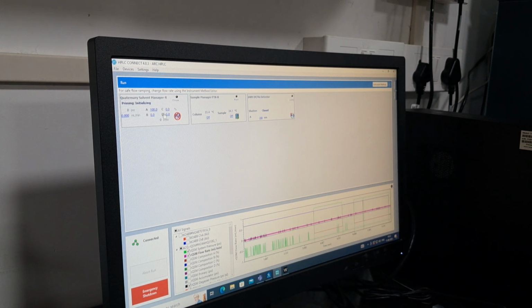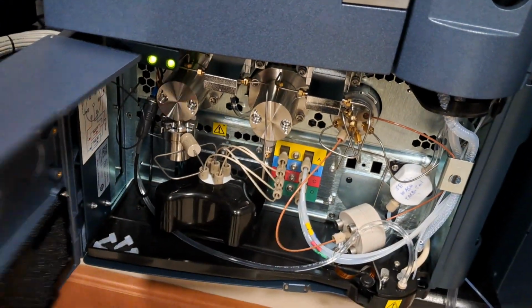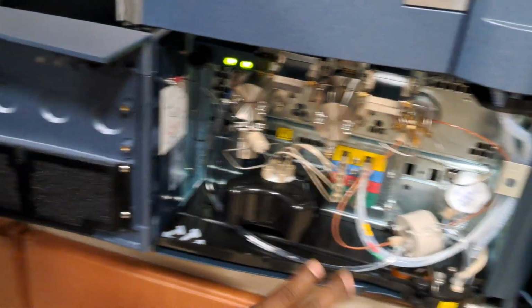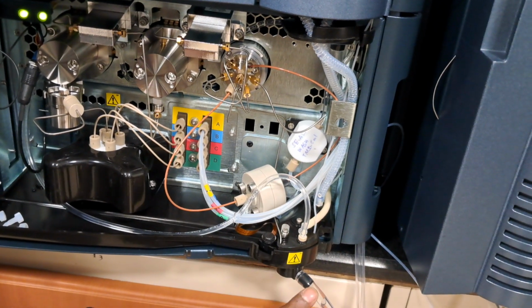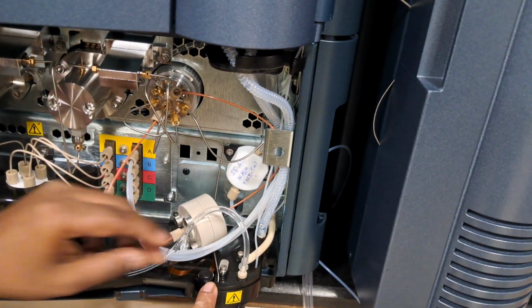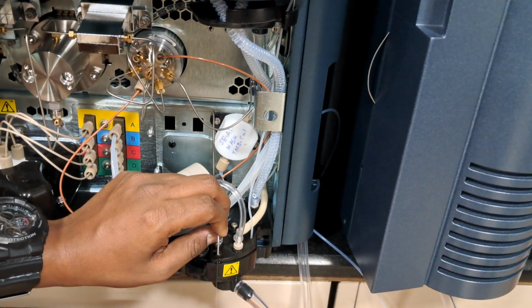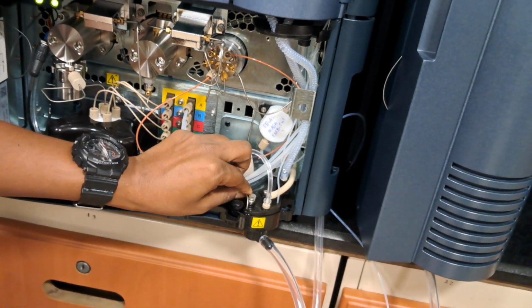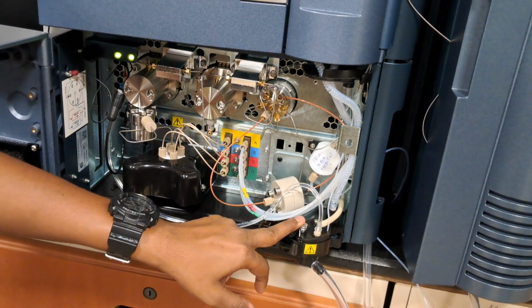You want to show the outlet flow. The outlet flow, we have to check it. Now the pump earlier was in off state. Now it will come to the flow. Now the pump flow, it will come through this one, the pump priming actually. So you can see the flow is coming here. This channel is the one. No need to take it out. The flow will be coming in a very fast direction. So this is called the pump priming, wet priming or pump priming. That initial one was seal wash, and this is called the pump priming.